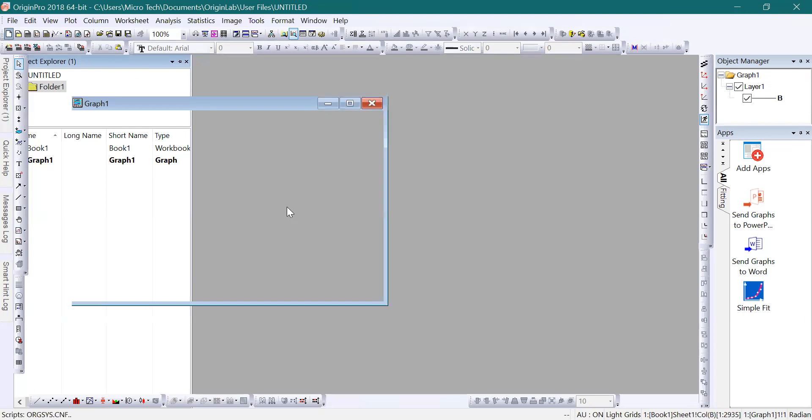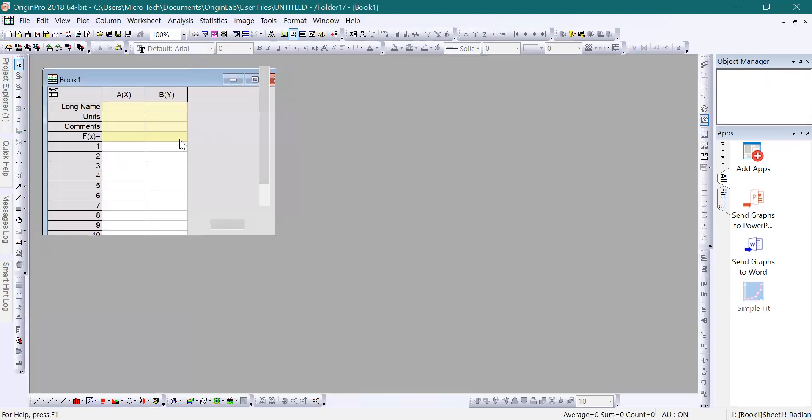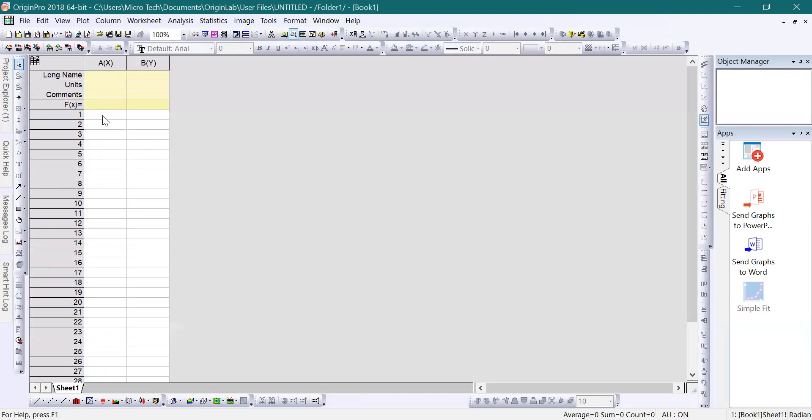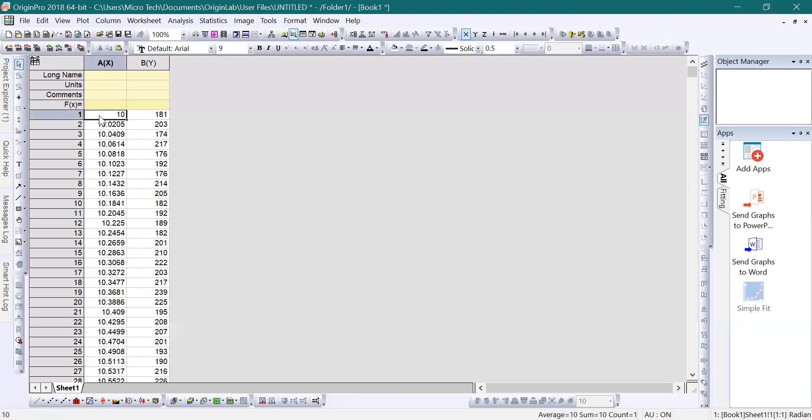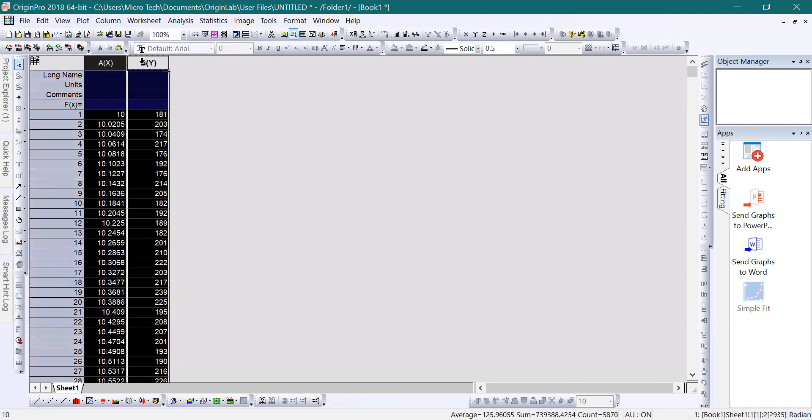Now here we have a new file. Simply, I'll put the data here. Now we have the data, and this data is ready to plot. Select both columns and click on the Plot option.